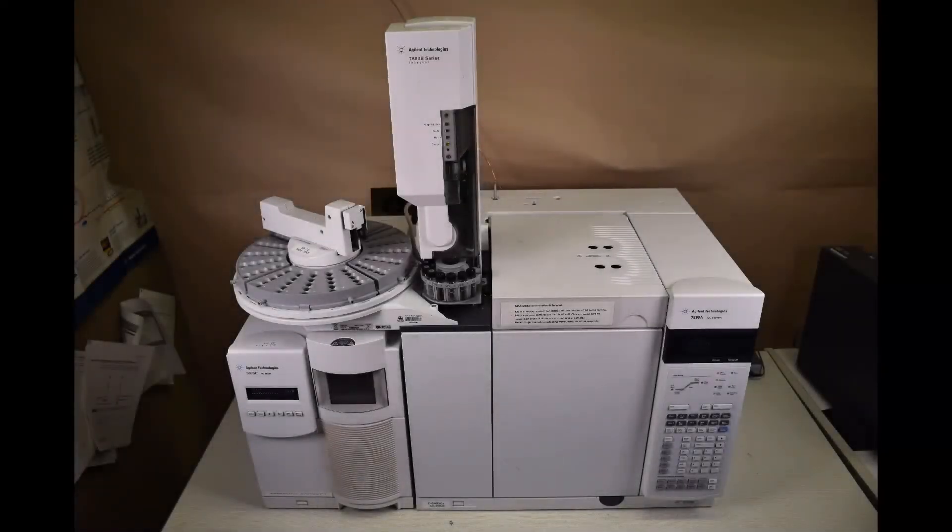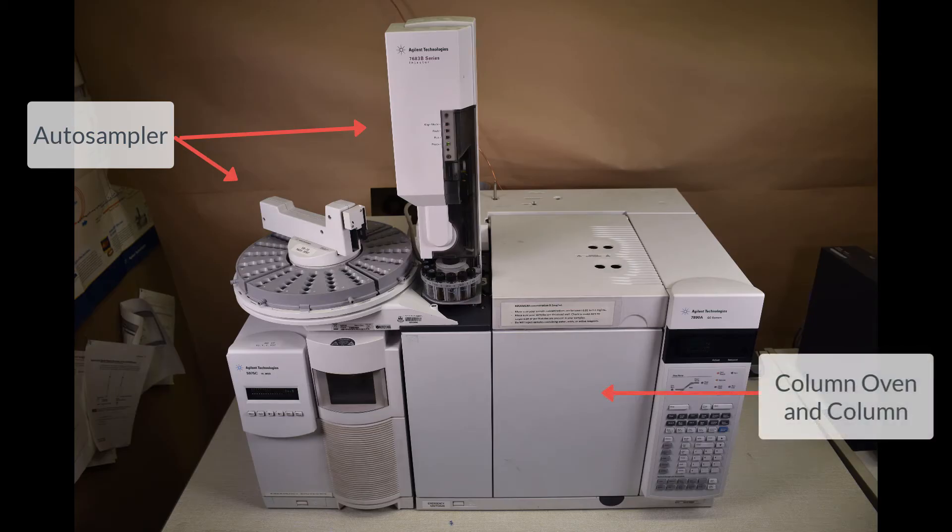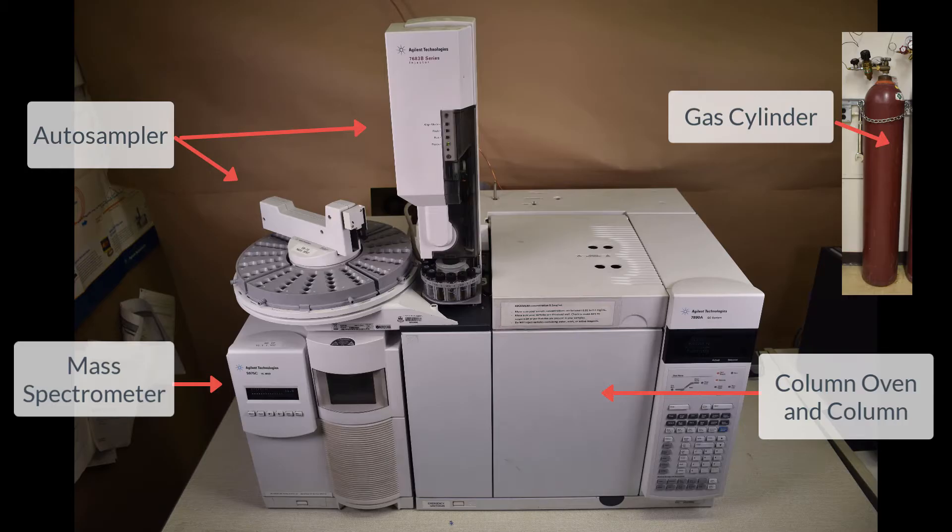This is a GC-MS composed of an auto-sampler, a column oven and column, a mass spectrometer, a gas cylinder. Not shown is a computer that controls the GC-MS and collects data.